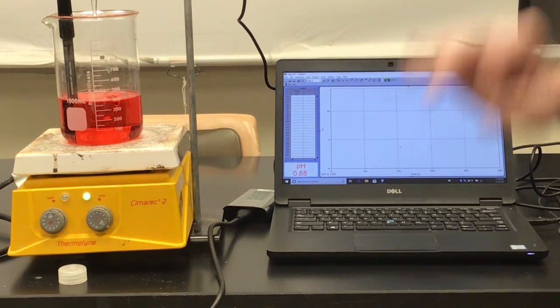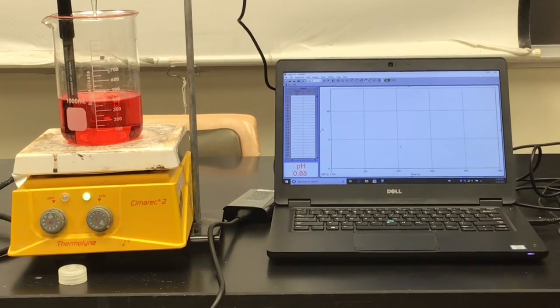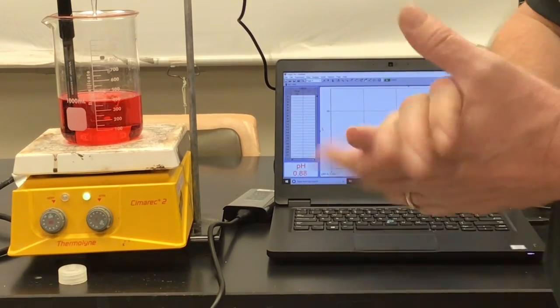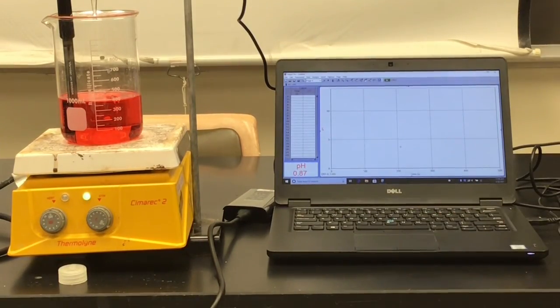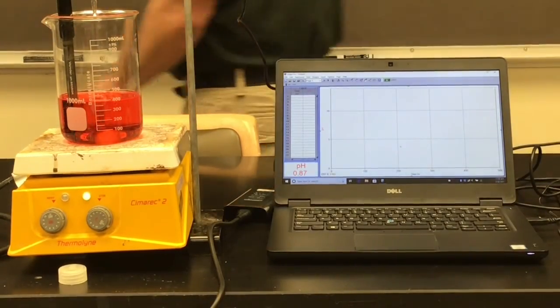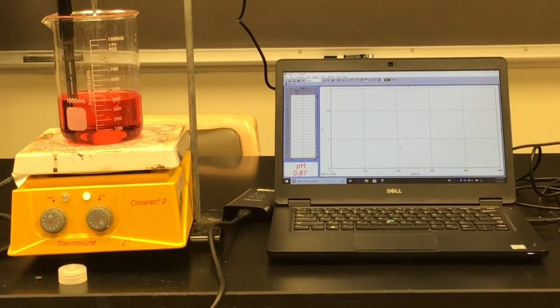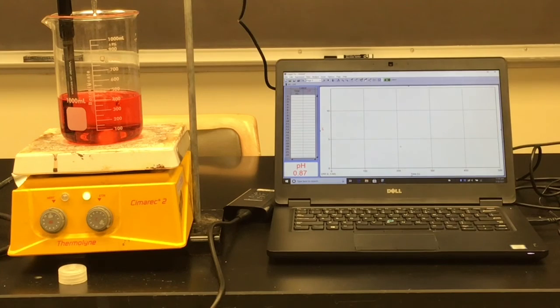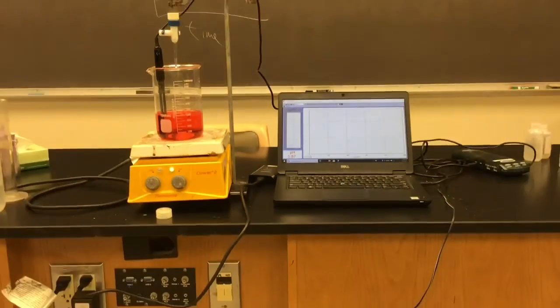If we are talking about a constant rate of data collection here, normally things that are a constant rate are a straight line. So most of the time, students will predict that if you are talking about pH versus time, you are probably going to see a straight line going up, and then you should see it change from red to orange to yellow to green to blue to indigo to violet. We should see a nice rainbow of fruit flavors here as the reaction goes.